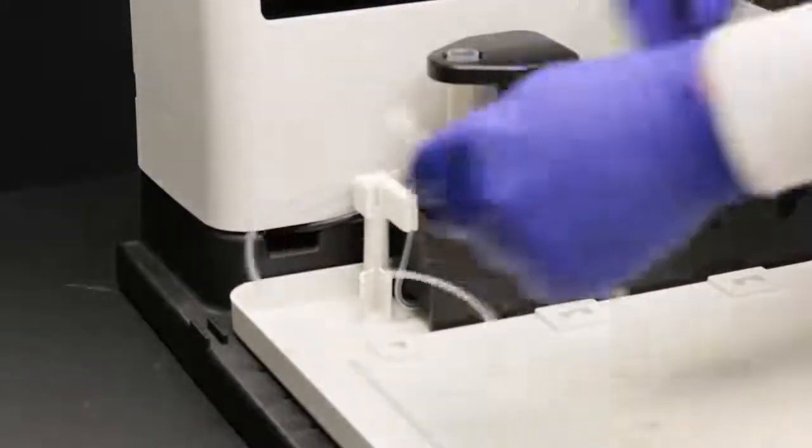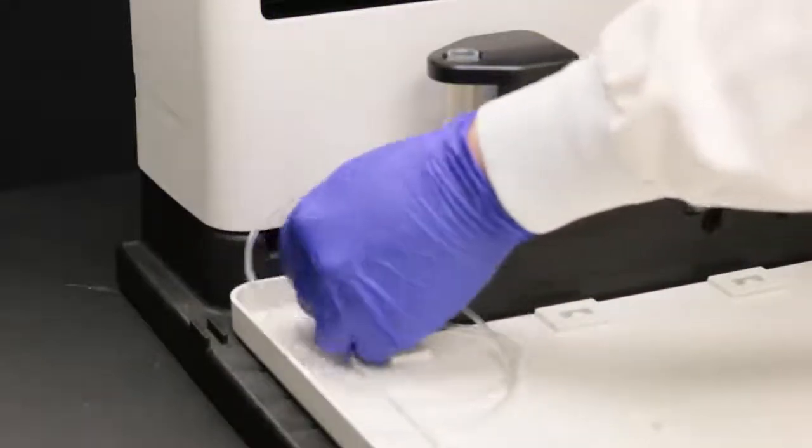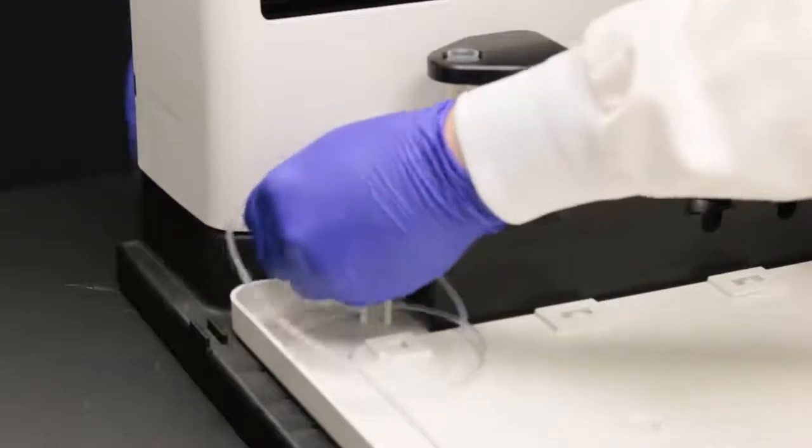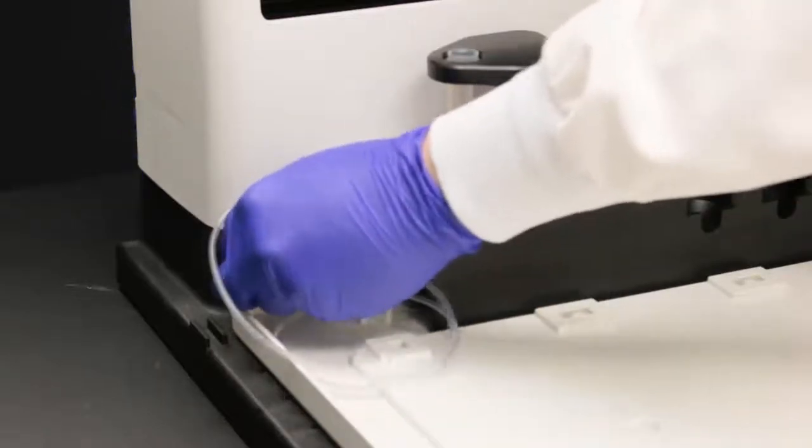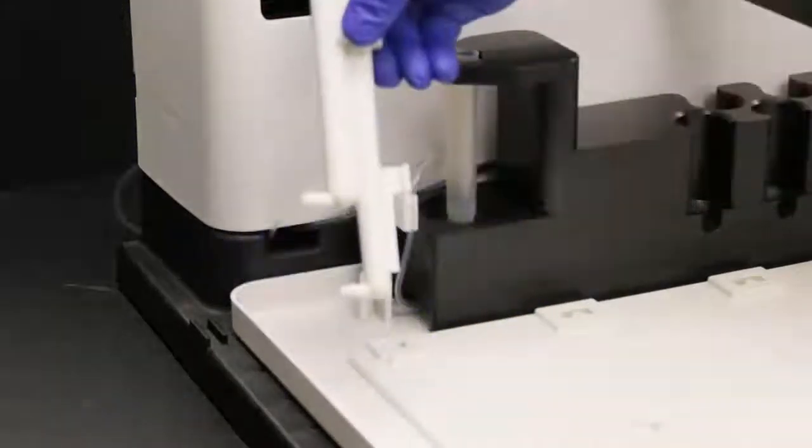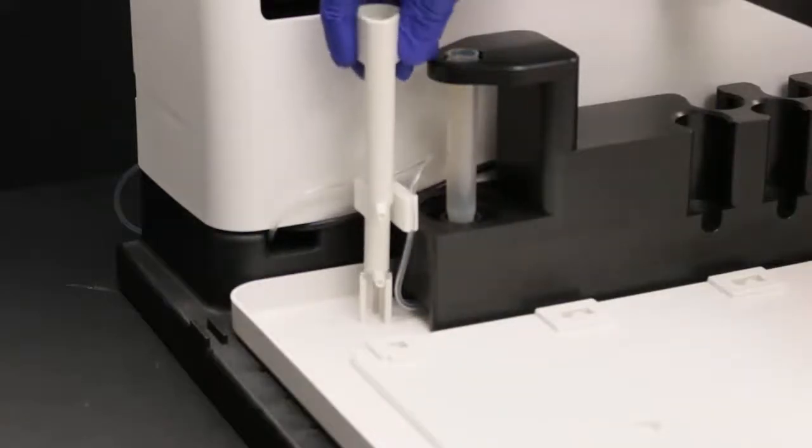Thread the tubing through the hole in the base of the auto sampler. Install the auto sampler rinse station by pressing it straight down.